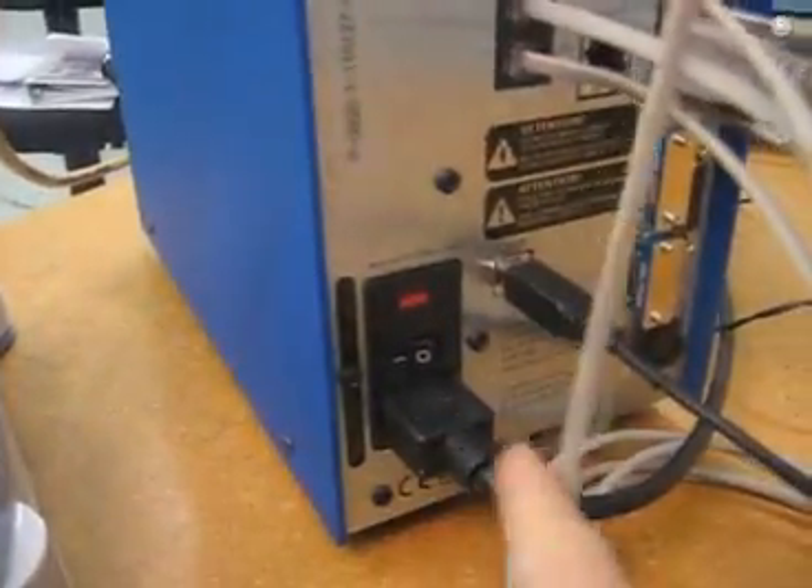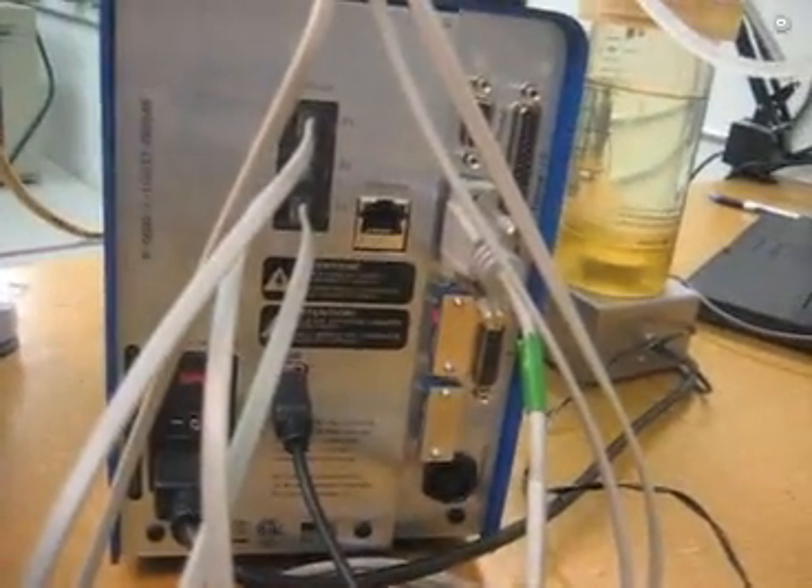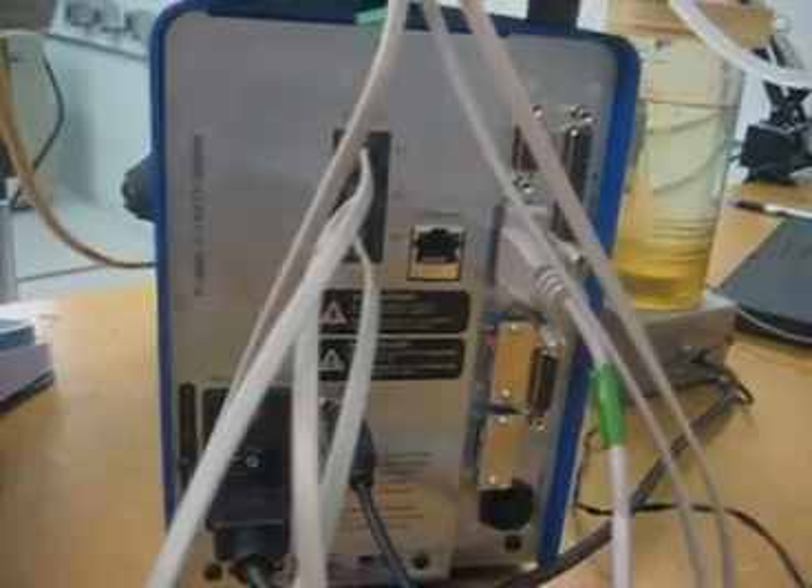Here's the on/off switch for the PureTech and the power cord. So that's pretty much all there is to connecting it. It's easier to connect than a personal computer desktop that you might buy.